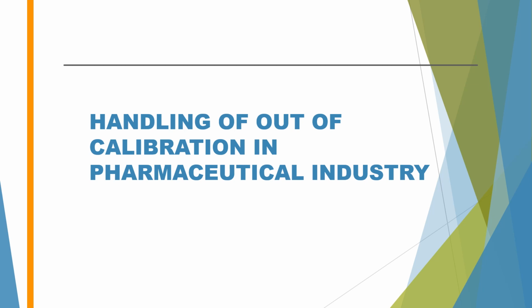So in this video, we will discuss the details of out of calibration and how to handle the out of calibration results.